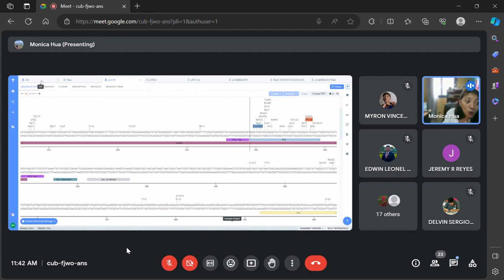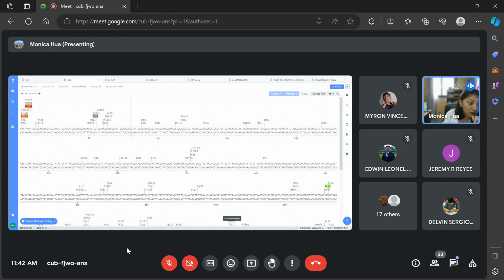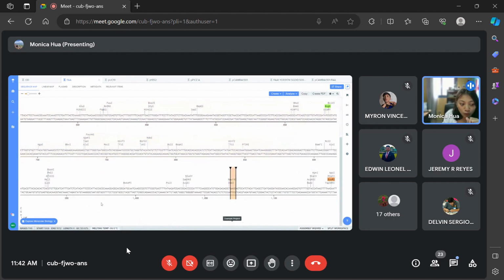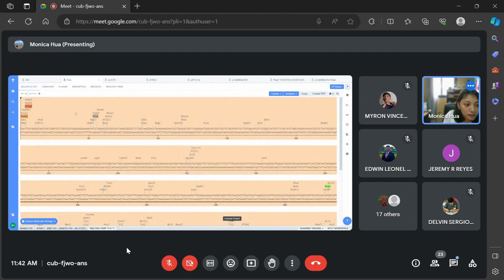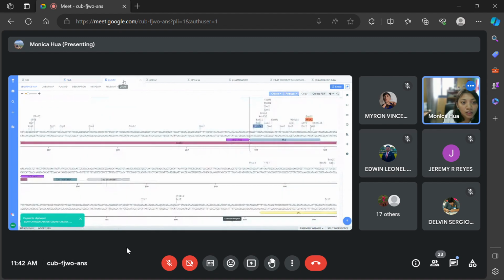All right. Then you're going to take your ORF sequence with your restriction enzyme site. I'm going to insert my FAA since that's what I have. Copy the DNA, go to insert bases, right?